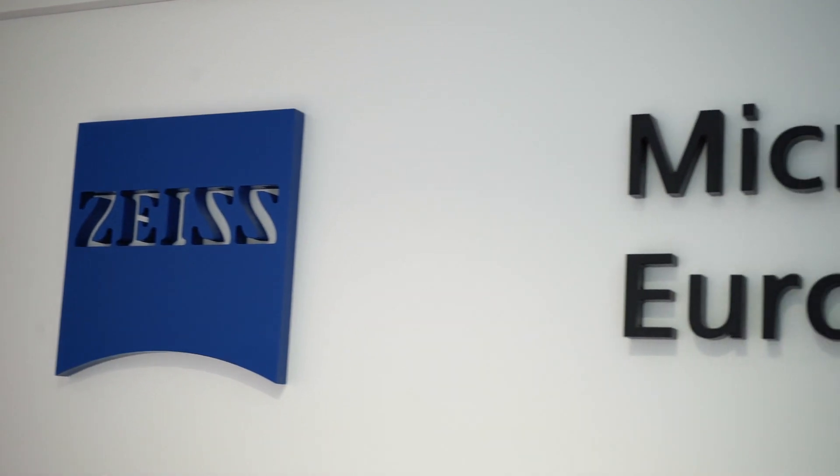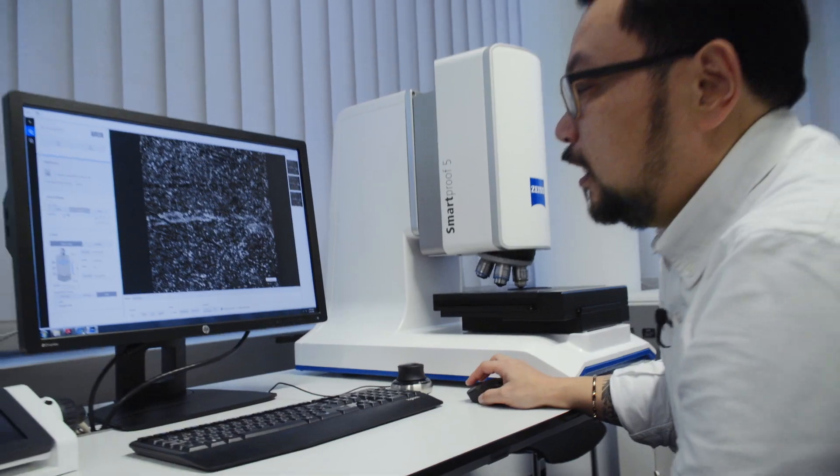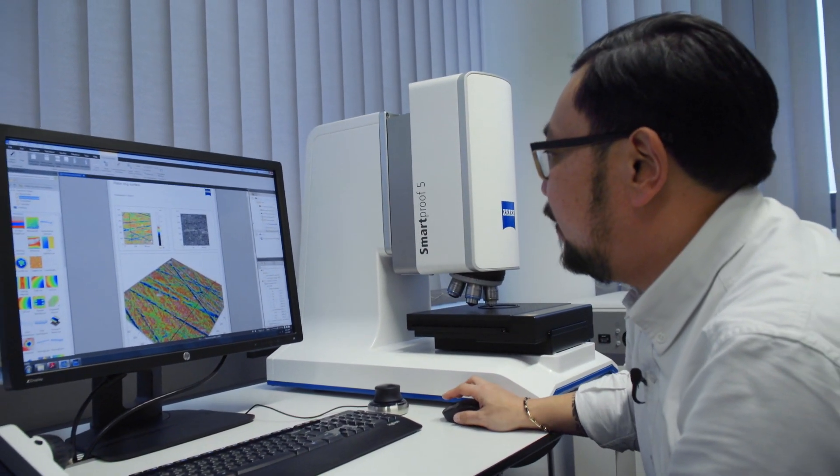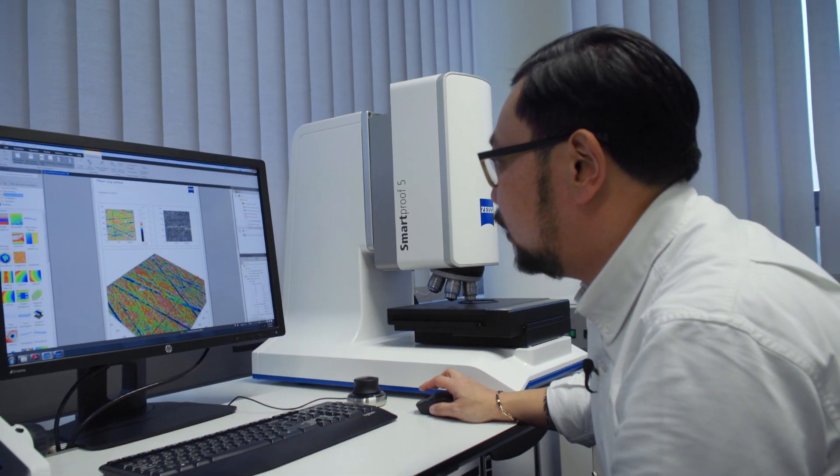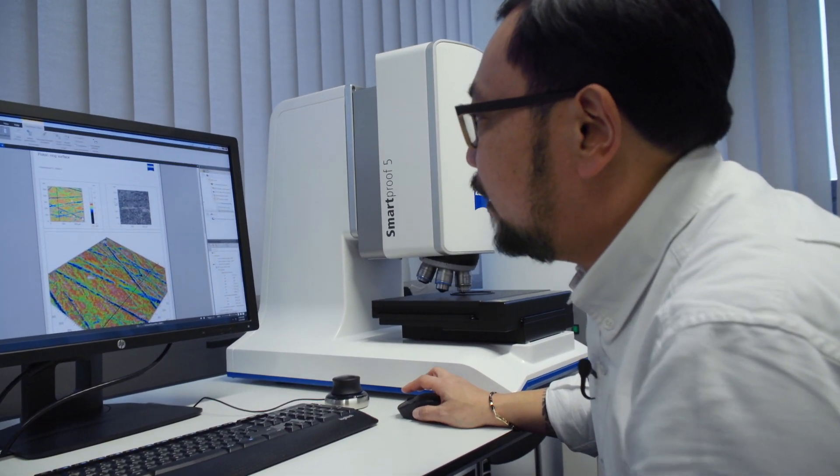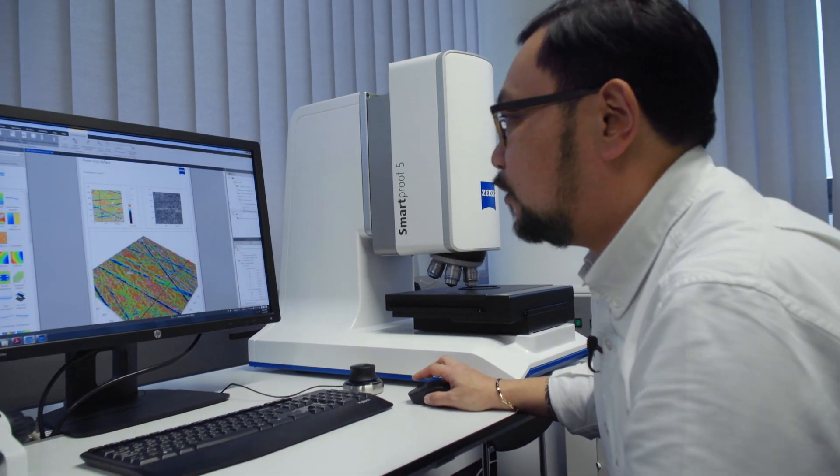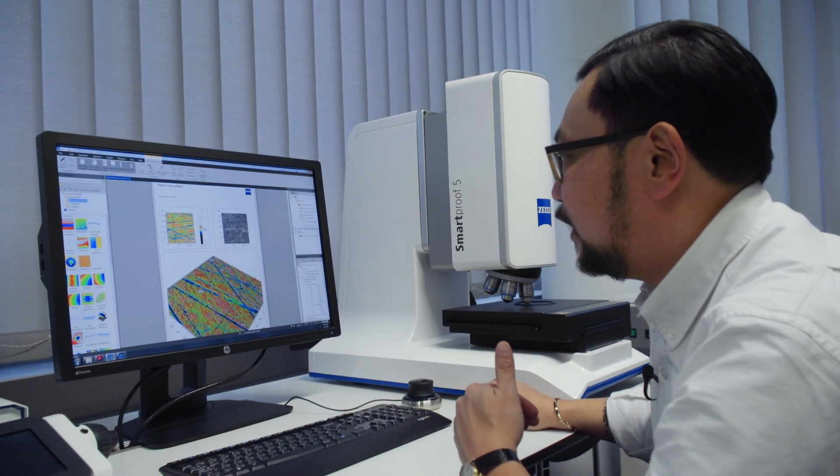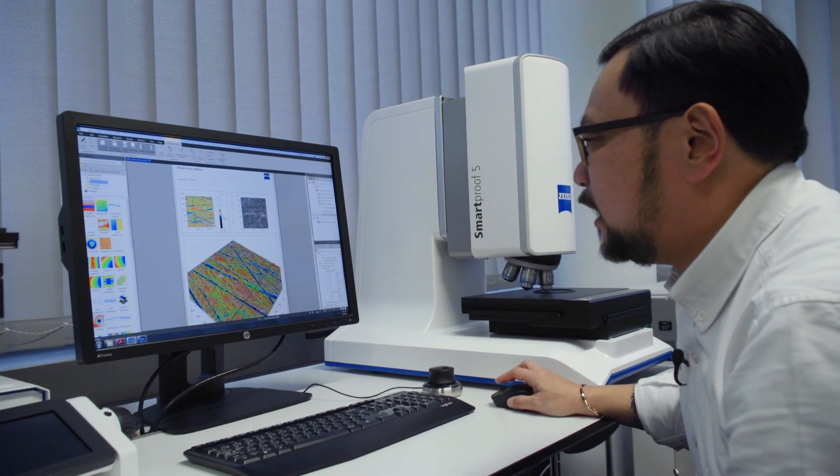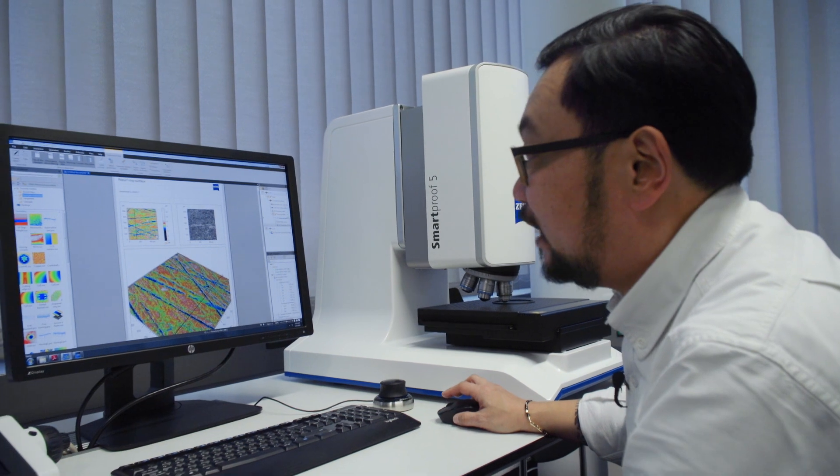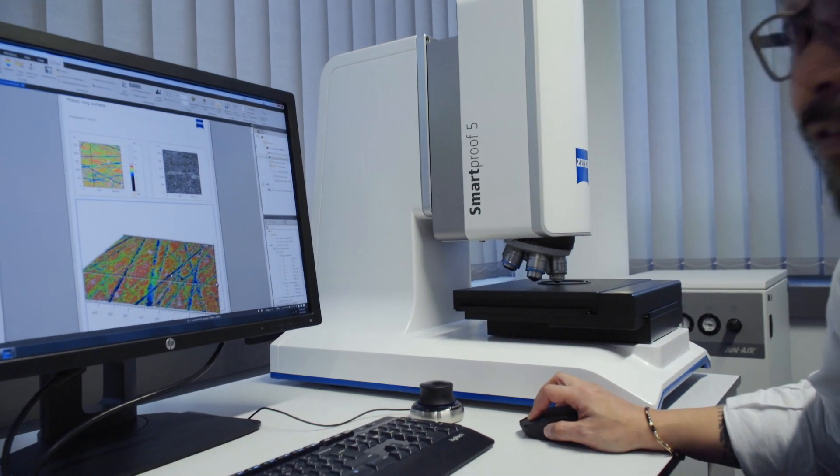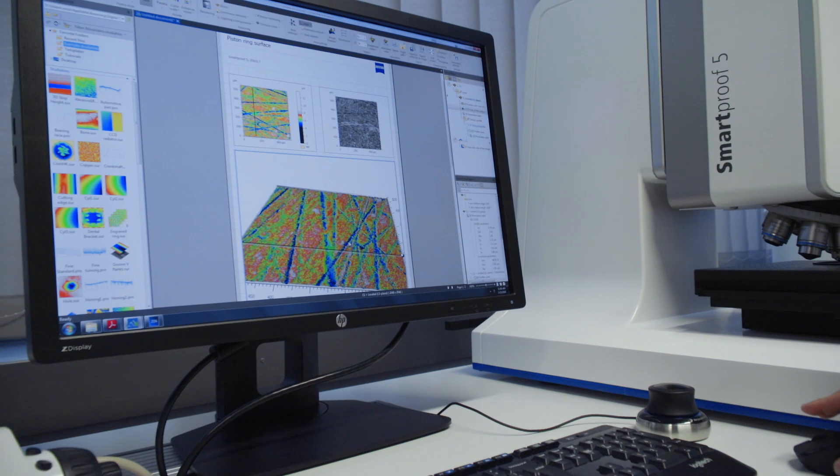So now that the images are acquired we can go to the analysis portion of the system. Here you can see we've got a view of what it looks like, the surface texture of it, and then we overlaid a color map so that you can see the gradient topical view. You can even see from the colors here that a peak to valley measurement is within the two and a half to three micron range and that's very easy to see right here. We also have an isometric view so that we can go ahead and have a look at any angle of the entire topography.